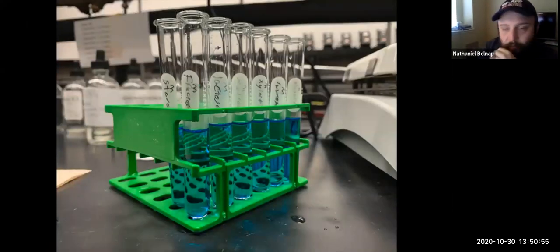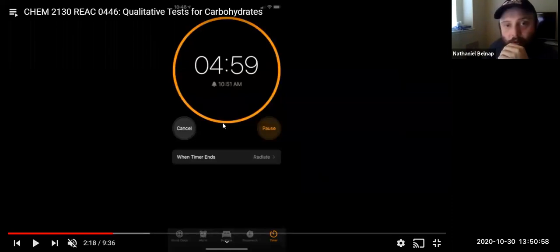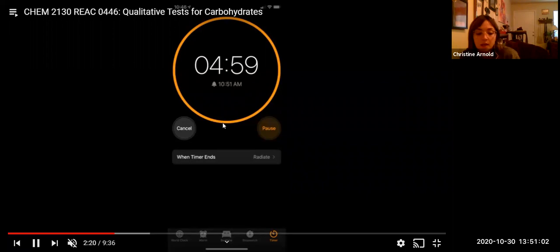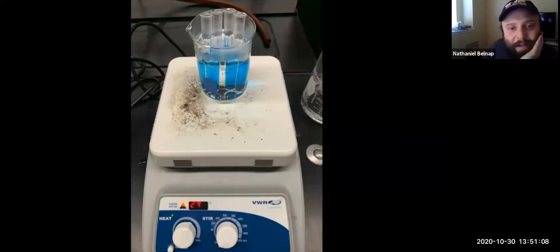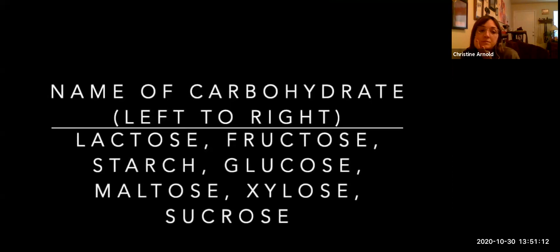So I don't see any red precipitate. Oh, we're gonna do that next. So should we put negative for this, the BARFOED'S, right? Let's hold on a second. Let's see what happens after this.